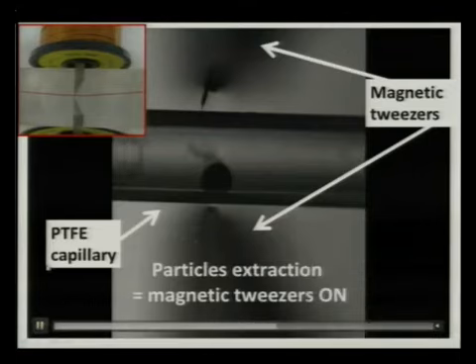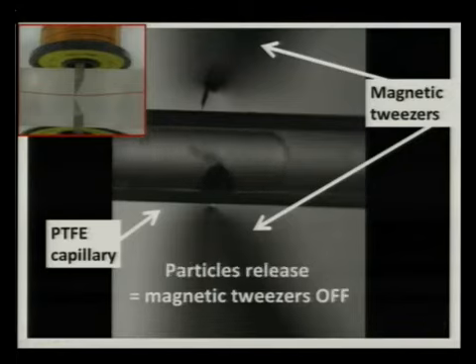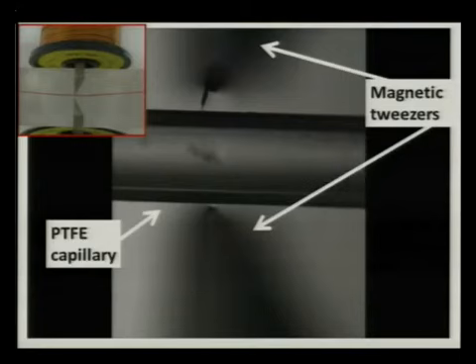Yeah, okay. So when the second droplet is coming, we can switch off the magnetic field, and in this way we release the beads in the second droplet. So this is exactly what we can do in a tube, for example, but using droplet microfluidics.